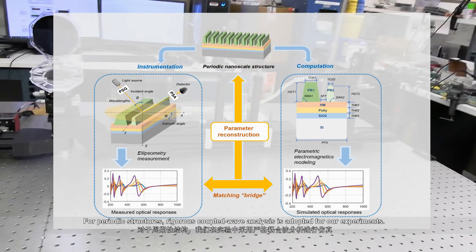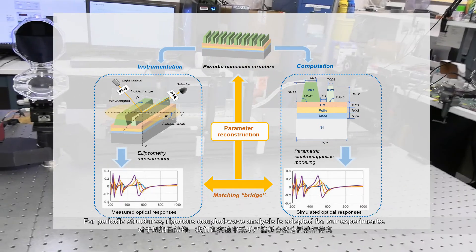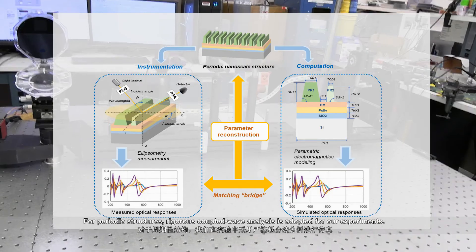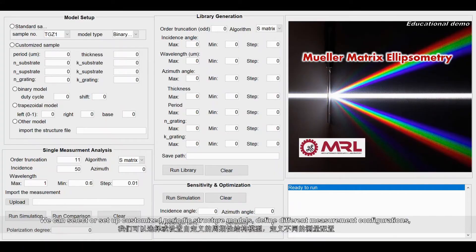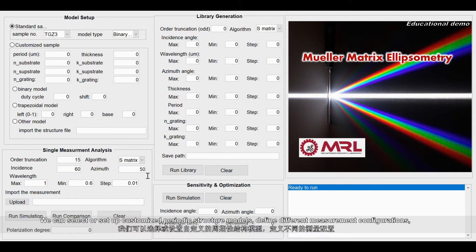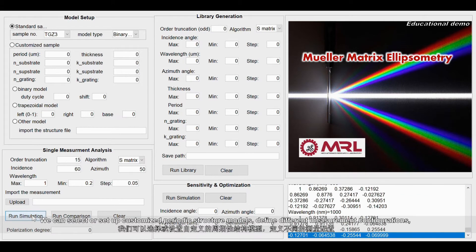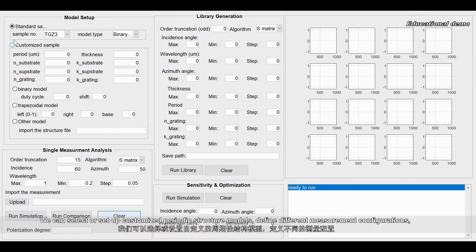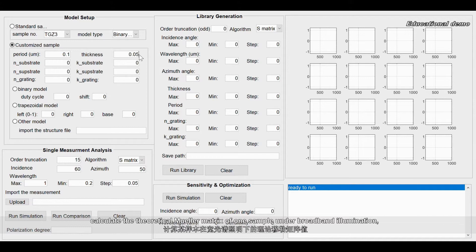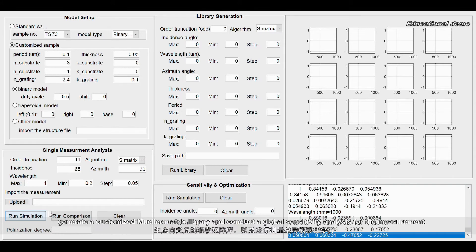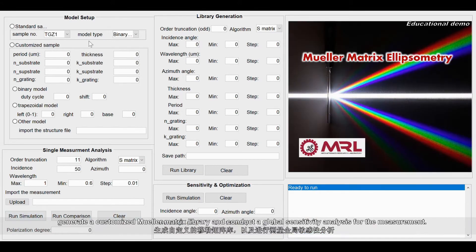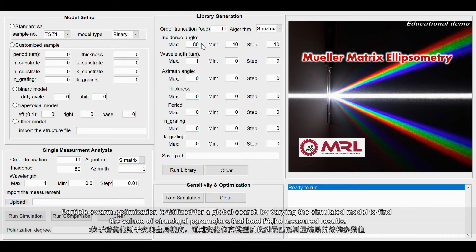For periodic structures, rigorous coupled wave analysis is adopted for our experiments. We can select or set up customized periodic structure models, define different measurement configurations, calculate the theoretical Mueller matrix of one sample under broadband illumination, generate a customized Mueller matrix library and conduct a global sensitivity analysis for the measurement.